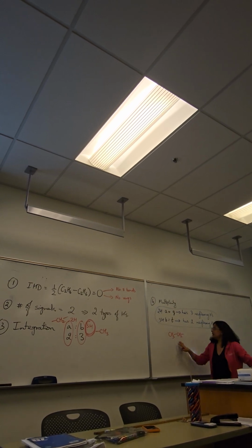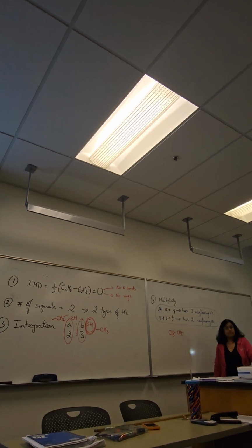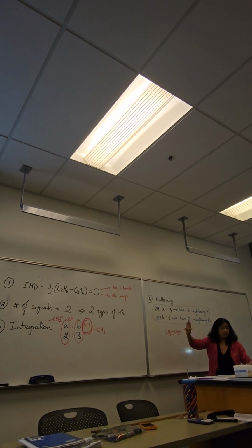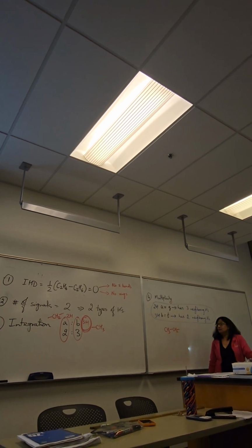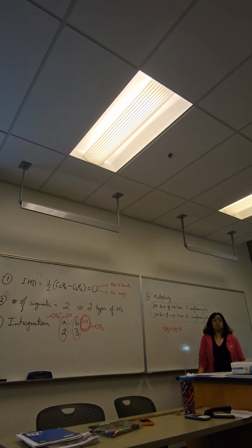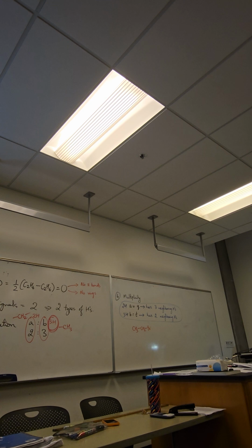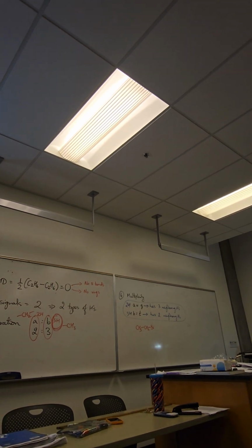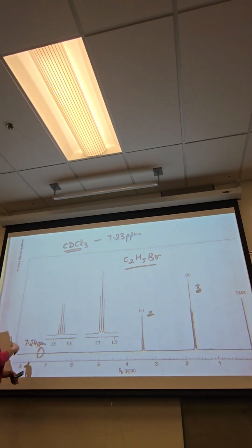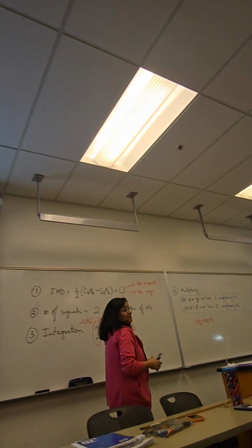How many carbons have we used up? 2 carbons. All carbons gone. How many hydrogens have we used up? All of them, 5. All of them done. What's left? Bromine. So where does that go? It goes to the right side. That's the only open position left. So one piece at a time, you start bringing the clues and putting them together. So this is basically a spectrum for bromoethane. Does that make sense? Yep.